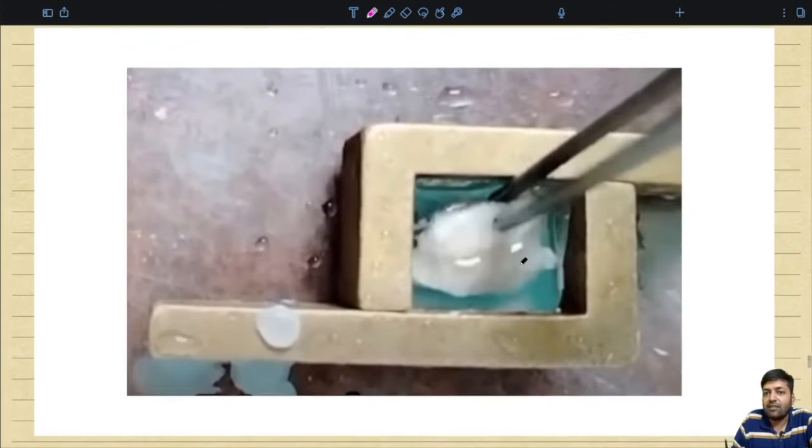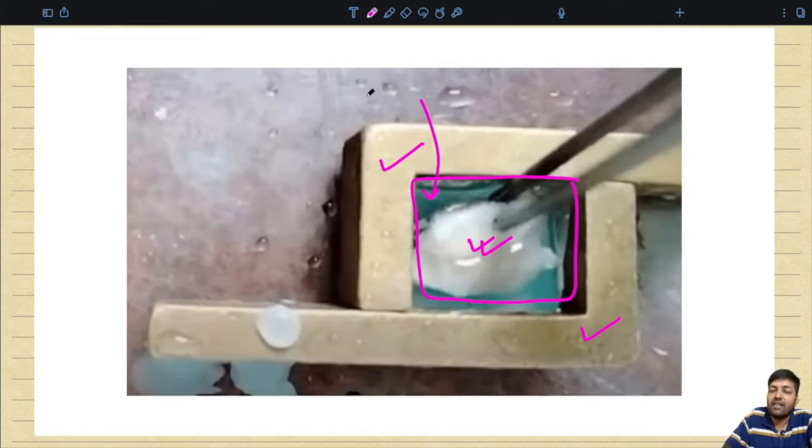For example, as you can see here, the two L molds are adjusted with each other for this size. This is the size that we are using. This is the infiltrated tissue, and we have poured molten paraffin wax over it in this particular space.